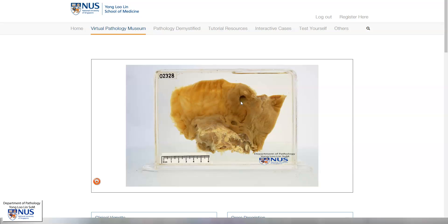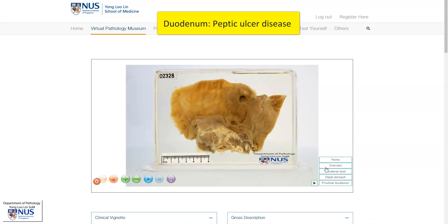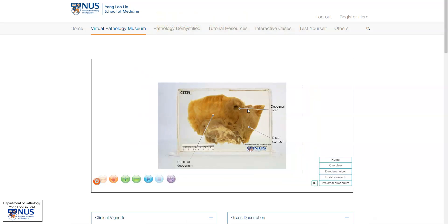Hello, this is a virtual pathology specimen of an example of peptic ulcer disease involving the duodenum. We can see two duodenal ulcers here. Let's orientate ourselves. In this area where the mucosa looks a little bit different, here is the distal stomach, the antropyloric region. These are two punched-out duodenal ulcers and this is the proximal duodenum.